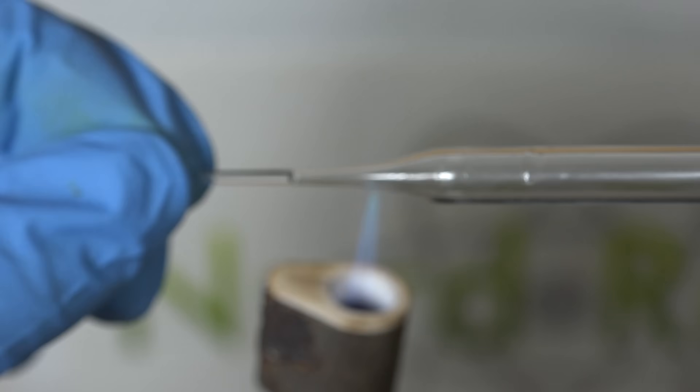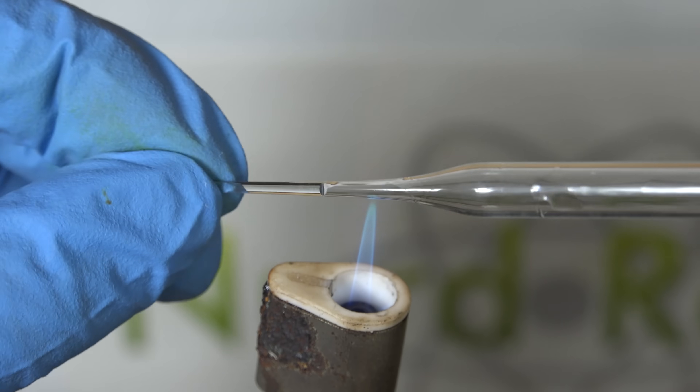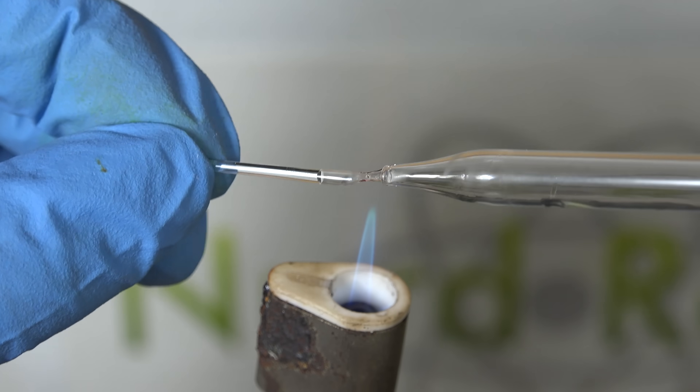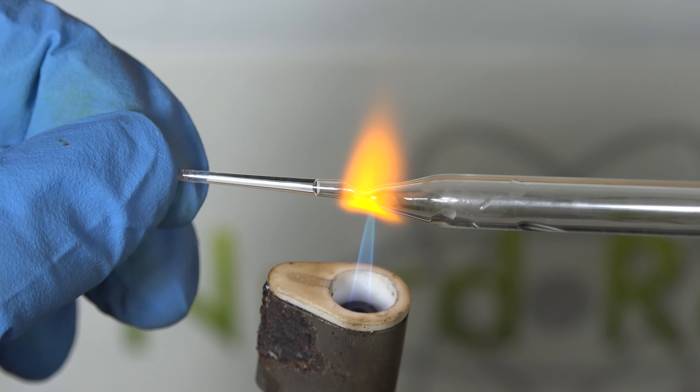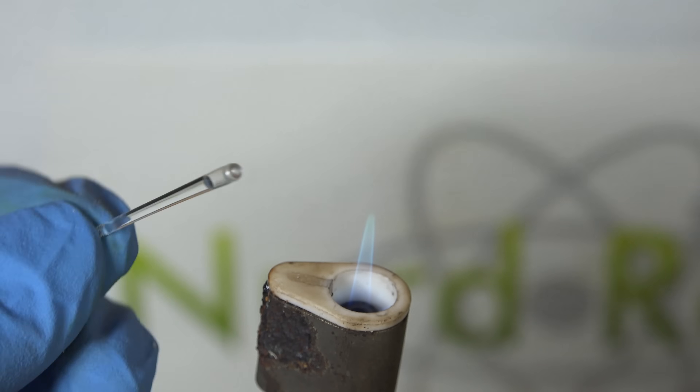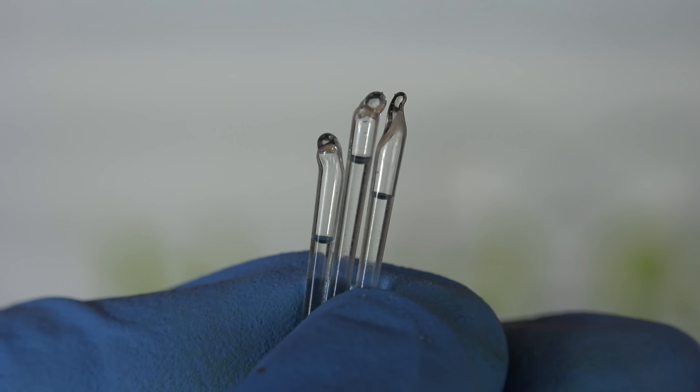To turn them into capsules we carefully flame seal the pipettes. I know I make this seem easy, and honestly it is — but wear gloves and a face shield. If you heat the capsule the wrong way near the acid it'll explode and splatter acid on you. Maybe practice a few times with empty pipettes first. And there we are — tiny sealed capsules of sulfuric acid.